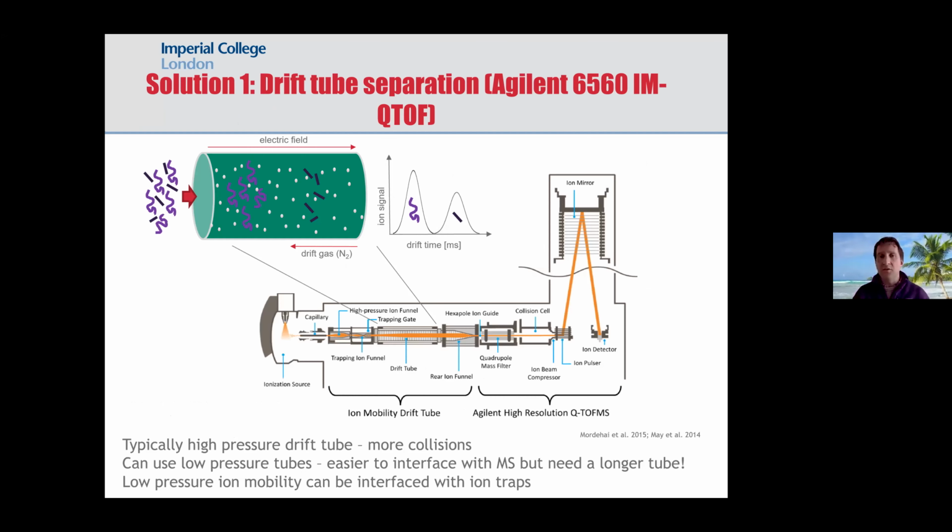So hopefully that gives you a bit of background in terms of ion mobility and where we're coming from. I'm now going to confuse matters by saying that, broadly speaking, there are about 4 different designs, and that's probably slightly inaccurate in that there are a number of hybrid designs in between these broad designs in terms of performing ion mobility.